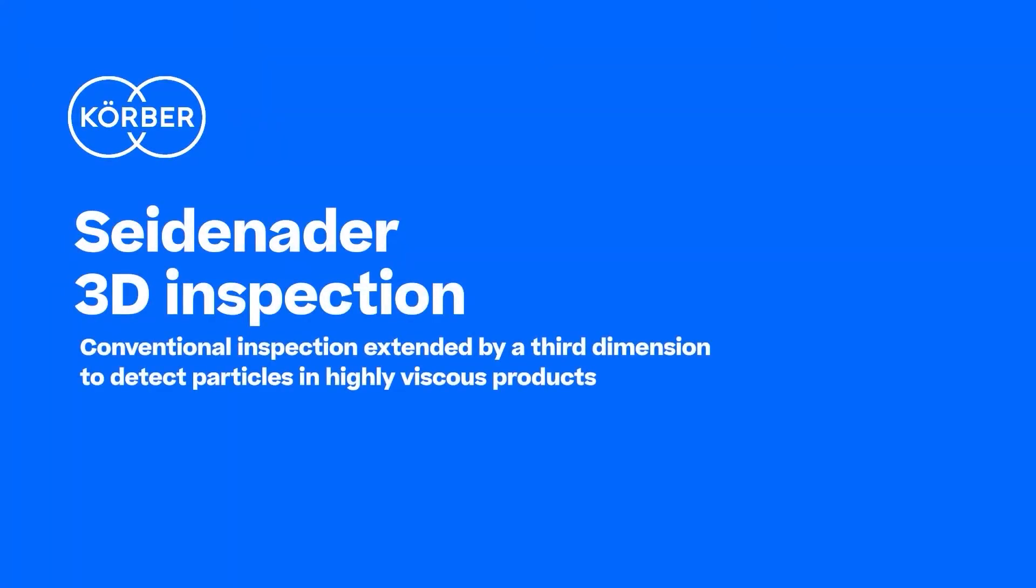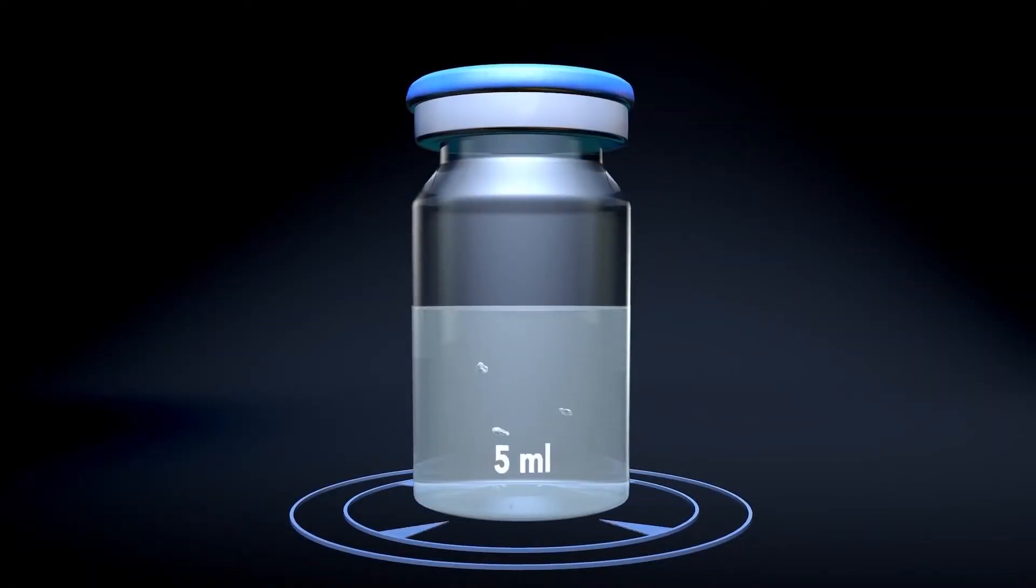Seidenader 3D Inspection: Conventional inspection extended by a third dimension to detect particles in highly viscous products. Inspecting highly viscous products can be quite challenging since reliable detection of particles with common inspection methods works only for liquid products.